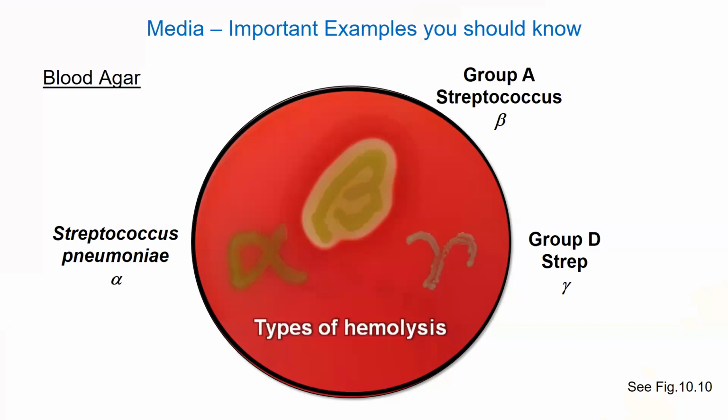The other thing about blood agar is it is a differential media in that different organisms can grow in different ways. So this is a slide, and you can see that there's alpha, beta, and gamma hemolysis. And that's what I want to draw a little flow chart for you to show what they are. So you can see that the beta hemolysis, for example, hemolysis means breaking red blood cells open. And you can see the beta hemolysis is the most complete. And you can see that there's kind of a ghosty halo around the colonies. And that's very distinct of organisms that do beta hemolysis.